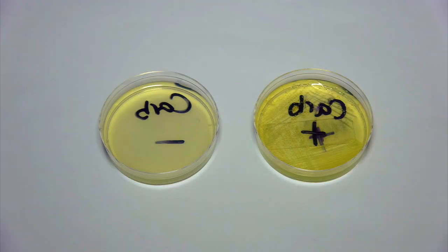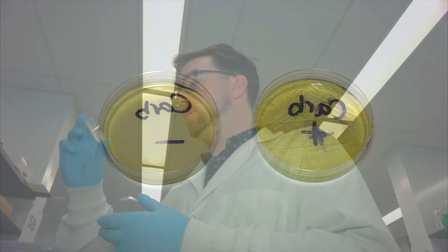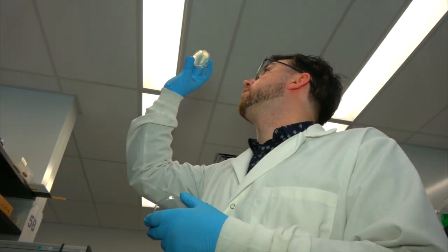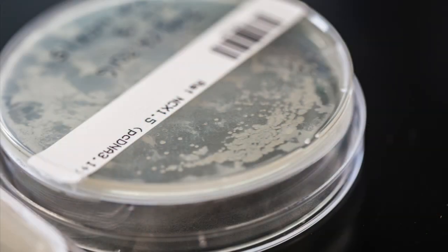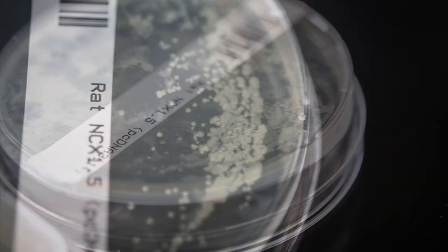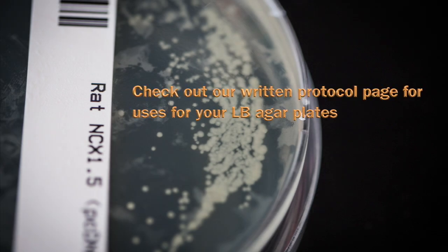If only the resistant strain grows, our plates are ready for use or storage at 4 degrees Celsius. Isolating individual colonies on plates is a crucial step in many experiments because colonies arise from single bacteria and are considered isogenic.